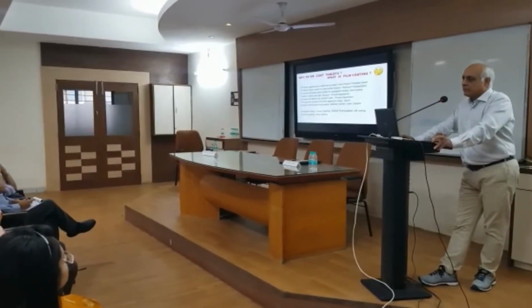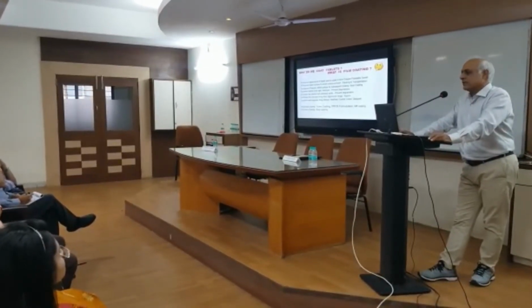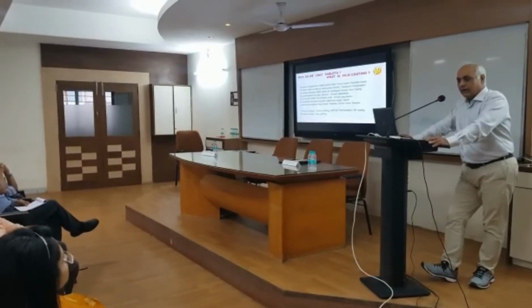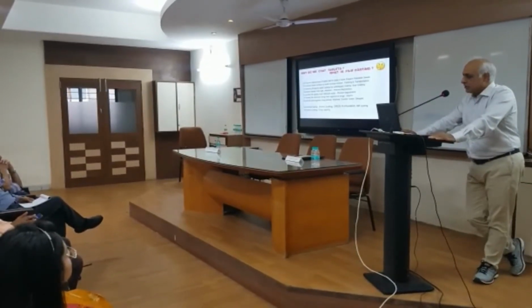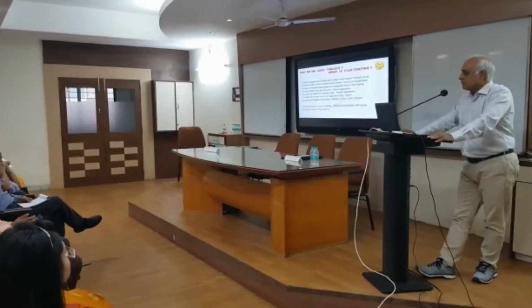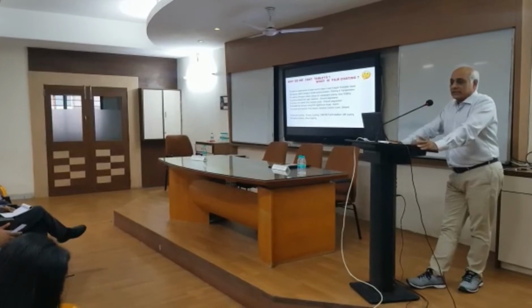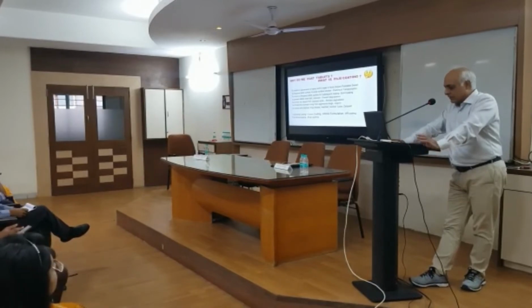So in order to make the surface ready for coating, initially we do a seal coating and subsequently over it we do film coating. So we are making the surface ready for film coating through seal coating. As we discussed, we are protecting the tablet from light degradation, from moisture, and from degradation because of the acidic media in the stomach. Also, we are ensuring that our gastric mucosa is not impacted by a drug molecule like aspirin.